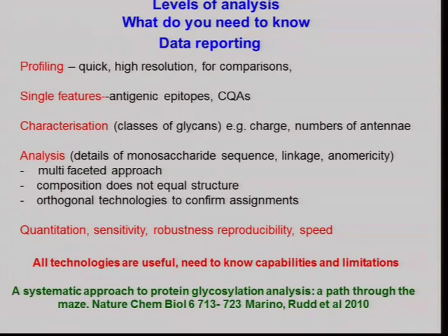And also the speed. Well, the speed is really important, but not at the expense of getting rubbish data. So there's no point in having a very fast method if it's not reproducible, if it's not sensitive, if it's not giving you the kind of information you need. So you need to think, what's the most important thing about this analysis? Do I need something very quickly and I'm prepared to sacrifice the quantitative nature of the data, for example?